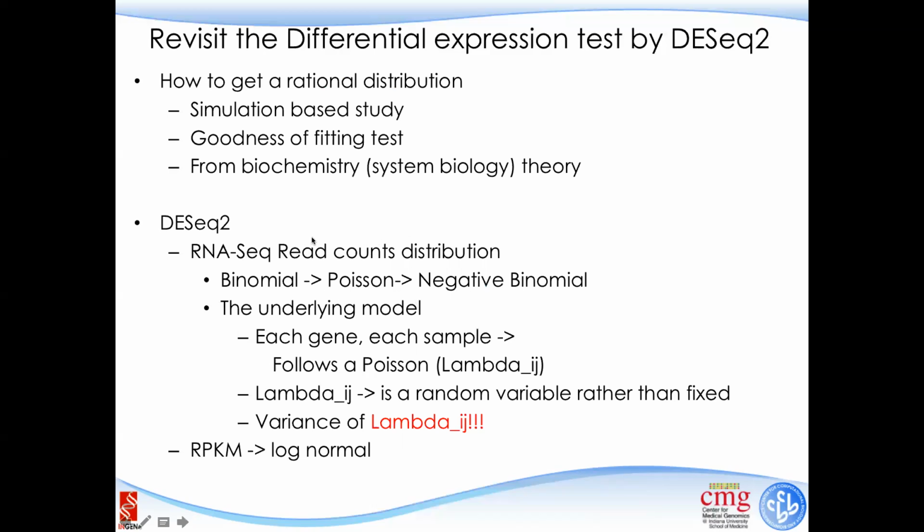Yeah. And this is just about the background of the distribution assumption of DESeq2. And the other one I want to talk a little bit about here is the RPKM. Like we have mentioned about RPKM.